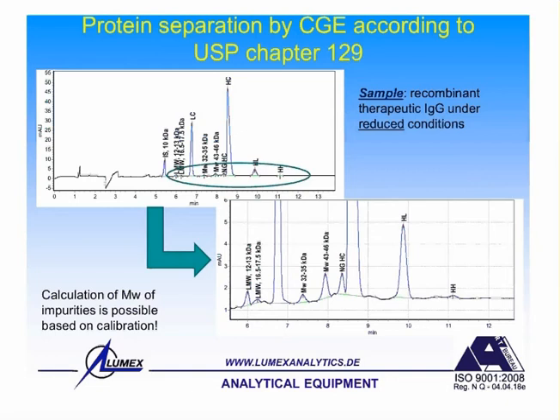If you dilute the ocean water properly, as far as I remember, we did it for about 500 times, then you get a huge peak of chloride when you analyze anions, but you also still get small peaks of other components, for example, bromide, which you can find in ocean water. Sulfate, definitely.